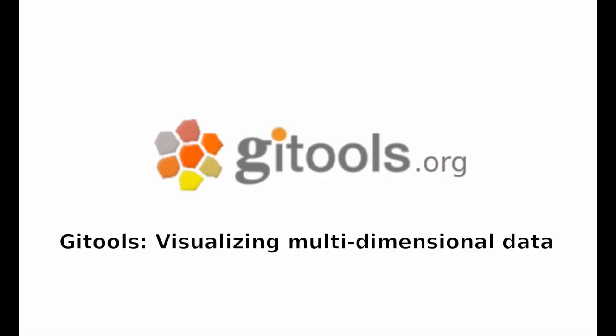In this video, we show you how to load and browse multidimensional data in Gitools.